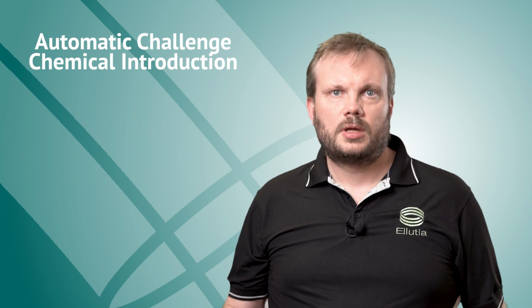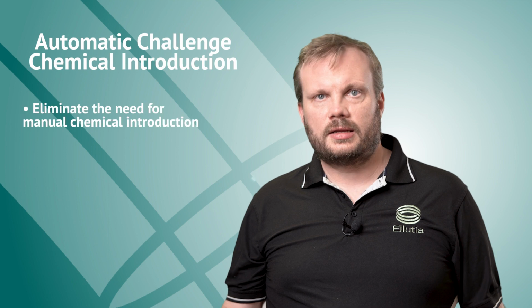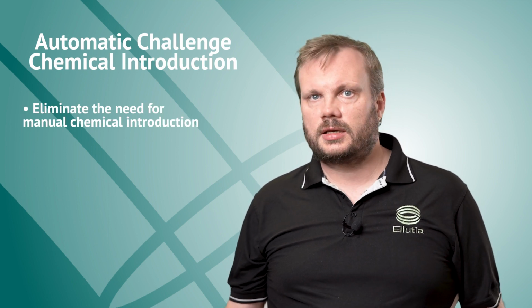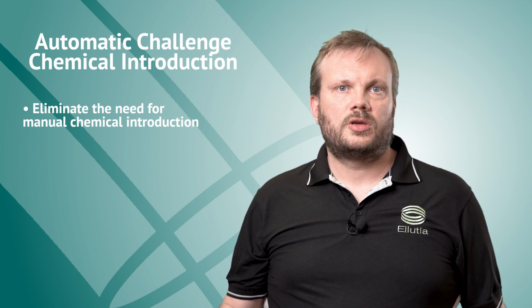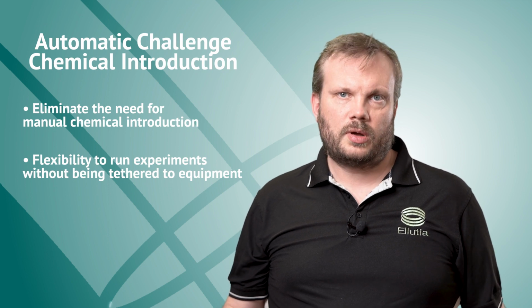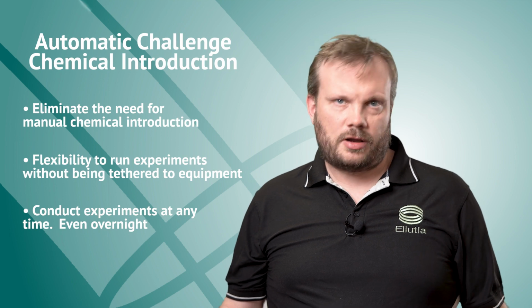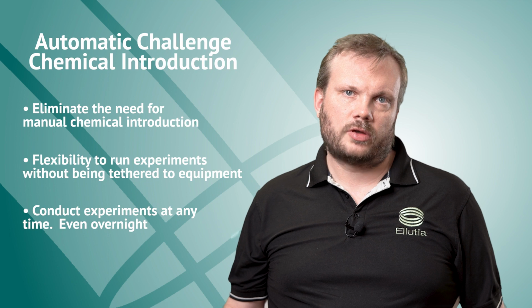By upgrading to an automatic challenge chemical introduction system, you can unlock a whole new realm of automation possibilities and eliminate the need for manual chemical introduction. This takes your permeation testing to a new level. With automatic challenge chemical introduction, you gain the flexibility to run multiple experiments without being tethered to the equipment. You can now conduct experiments at any time, even overnight, freeing up resources and dramatically accelerating the testing process.